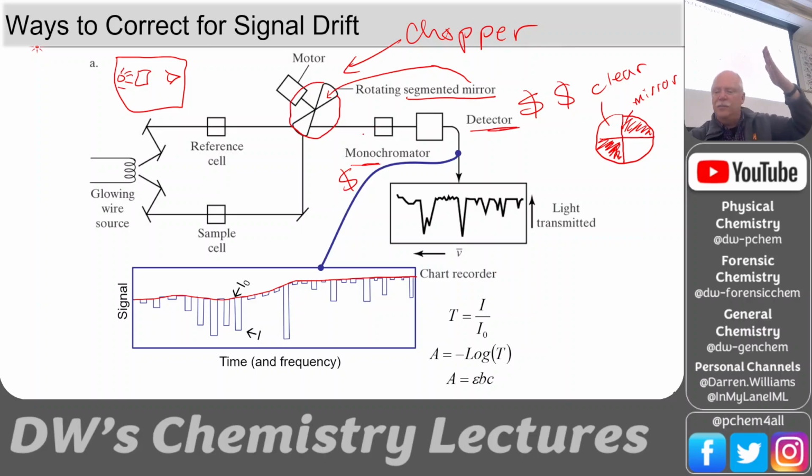And so we just angle this mirror so that light either goes through it from the reference cell or from the sample cell. So it'll block the reference cell and send the sample through, and then it'll rotate a little bit, and then the sample light goes through this way into a dump. Okay, we just dump that signal, and then the reference goes through.